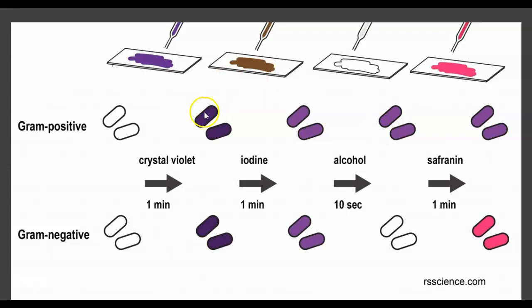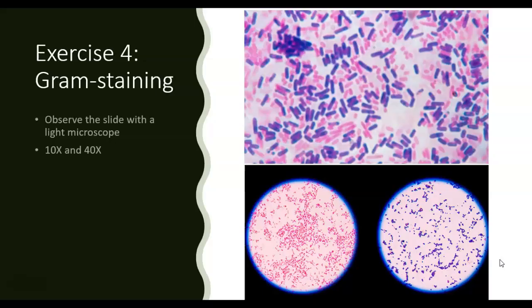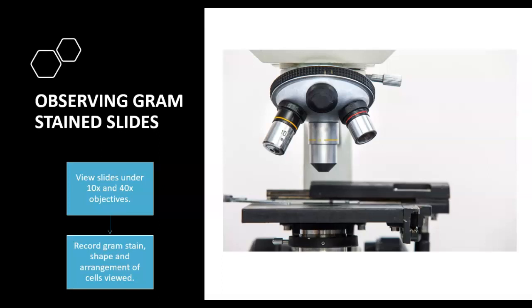What you'll notice is that if the bacteria are gram positive, they will appear purple. If they are gram negative, they will appear pink. Here you can see a mix of gram positive and gram negative bacteria — here's the gram negative and here's the gram positive. Bacteria are best seen under the 100X objective, which requires oil and is used in microbiology. For general biology, you will be using the 10X and 40X to look at bacteria. Also pay attention to the shape and the arrangement of the bacteria when you look at them under the microscope.